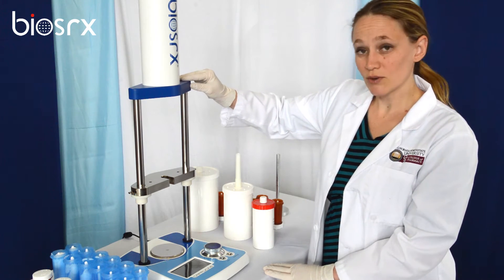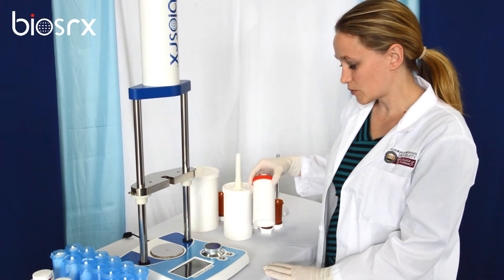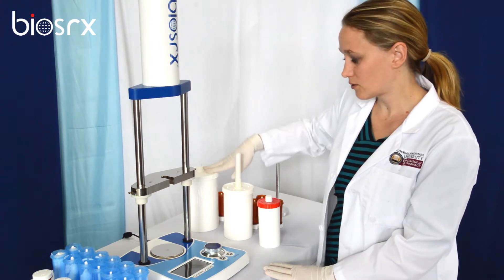Here we have the sensory panel, which has infrared sensors to detect the size of the EMP jar. It can detect the size of the 200 to 500, or the 1000.